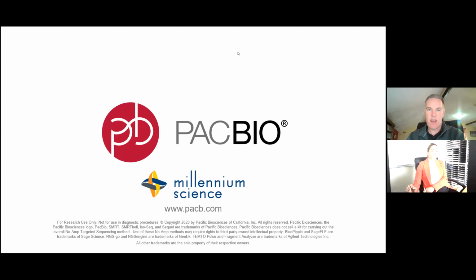And Patricia in the Q&A, is there any way to rid off human genome from whole metagenome sequencing? Yes, I think we very briefly touched on that in one of the slides. You can certainly look for the amount of human contamination in the databases, and if you follow the protocols that come through, you should be able to minimize that depending on the quality of the sample taken and the way you do your extraction. So you can specifically extract for the prokaryotic genomes and not from the eukaryotic ones, and hopefully that helps clean up. But I can certainly provide more information to you, Patricia, if you want, and provide any protocols that are available. Do contact me, let me know, and I'll be able to give you a much more complete answer to that.